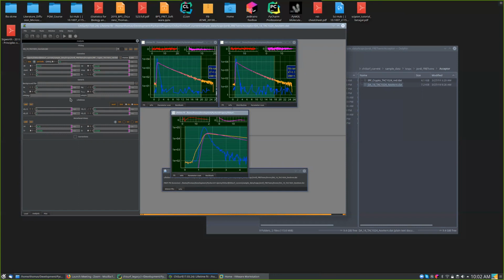You mentioned that there might be crosstalk from the donor to the acceptor, or there is surely, yes. So it might in principle be emission crosstalk from the donor to the acceptor. From the donor to the acceptor, there might be crosstalk of 50%, maybe. How much? 50%. 50% or more, yes. Oh, okay.